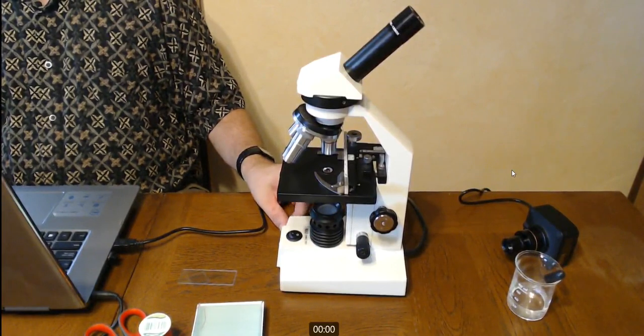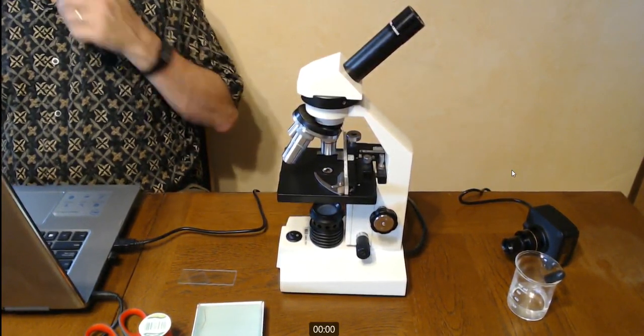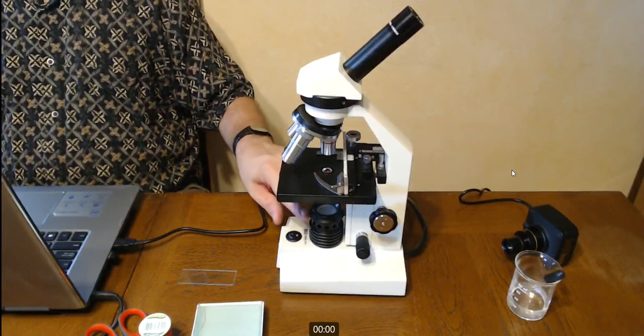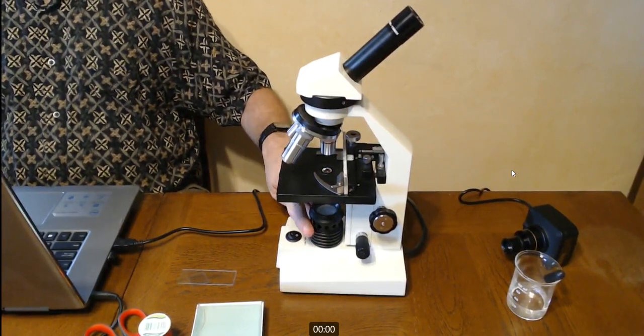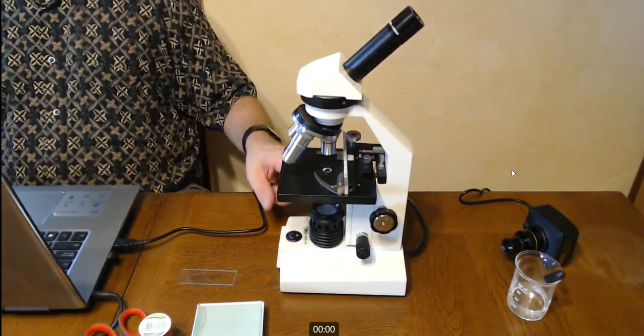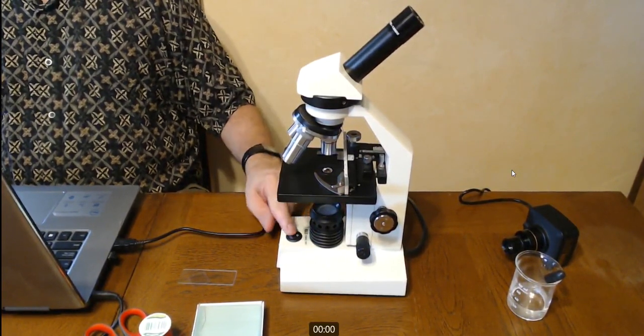Because this uses old-fashioned incandescent light bulbs, which give off infrared and thus heat up, if you have it on a long time, this heatsink can get hot. If you have a microscope like this, just be careful once you're putting it away. If you've had it on for a long time, that can get warm. So turn on the light.